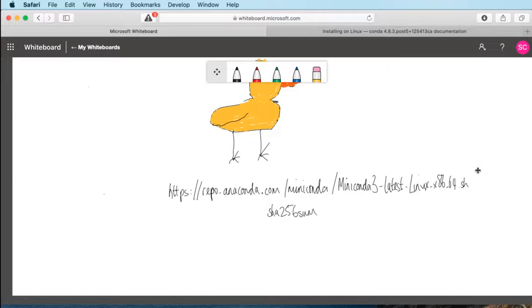against the hash that is written against the download on the website, just to make sure that the thing that we've downloaded is the same as the thing that they're distributing, that we haven't had somebody in the middle between Anaconda and us feeding us something which isn't the Miniconda installation script, because that's a script that we're then going to execute in our system. Because of that, we just wanted to make sure that it definitely is the thing that we think it is. We don't want to arbitrarily run code from the internet. That's not terribly good practice.